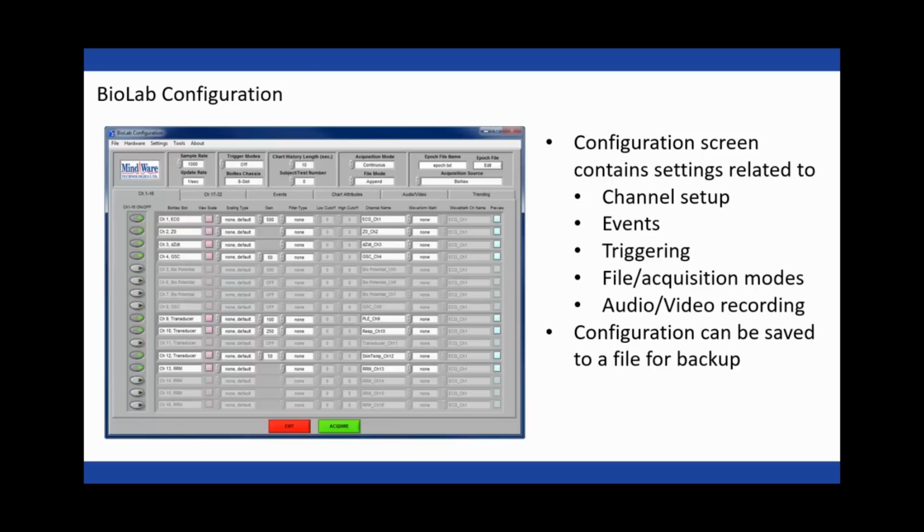We ended last time by speaking on the fact that configurations can be saved to a file for backup, or if you're using BioLab in a lab situation where multiple users are accessing it and using it slightly differently, you can use those configuration files to retain your settings and make sure that you're always acquiring the data that you want to acquire.